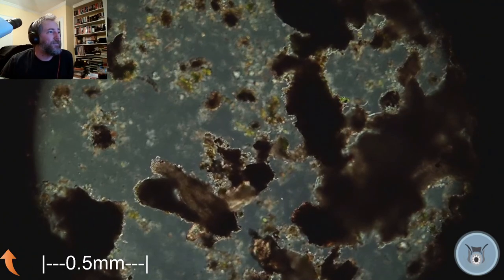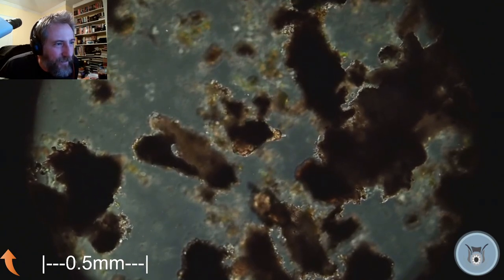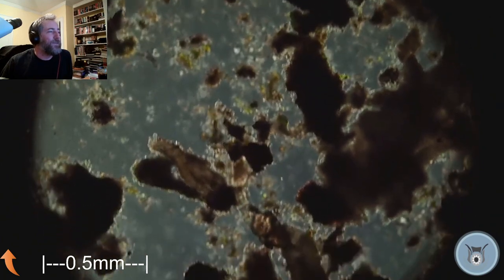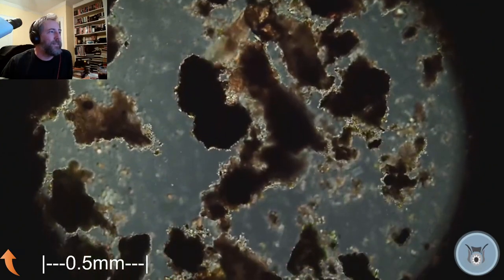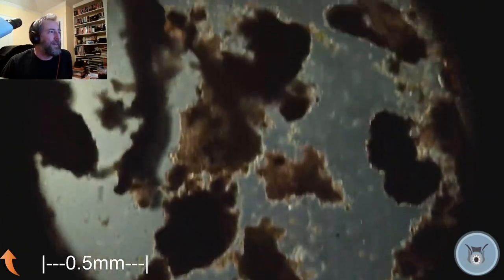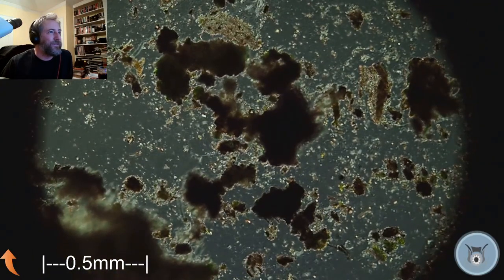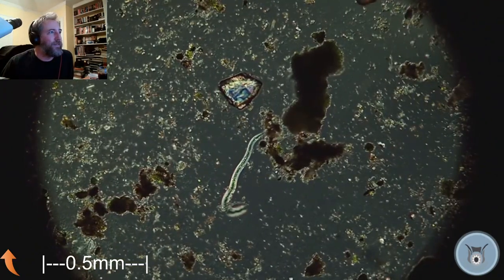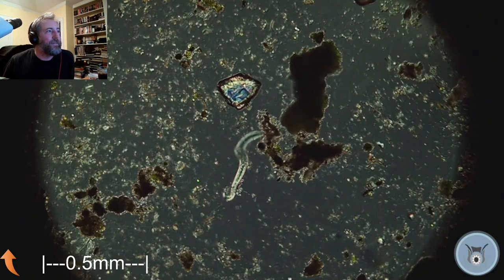All right. Well, I'm at the point where my microscope time was at 6 o'clock. Been running for about an hour and 15 minutes. I just wanted to do a little stream, sort of have some fun, look around at some rotifers and some water bears and some nematodes, and I don't know, maybe we'll catch a mite one of these times. I think we've done that before. Found some ciliates sort of cruising around in these samples. Sometimes we find some amoeba, but it's been a fun little stream.